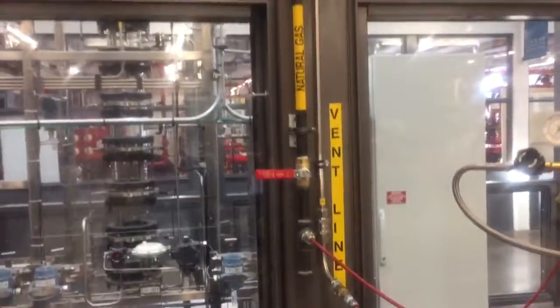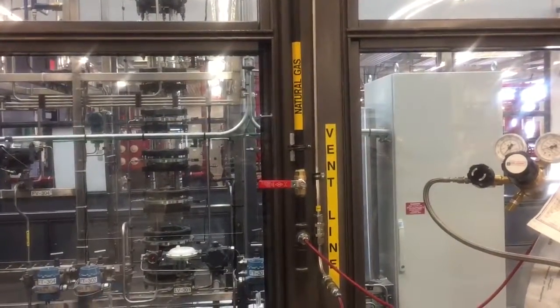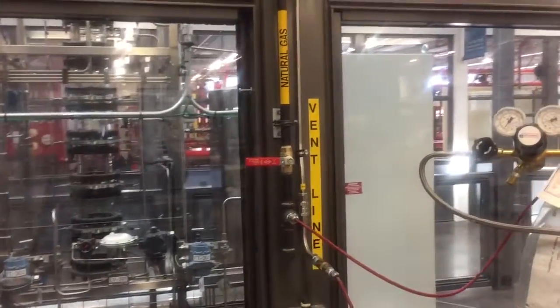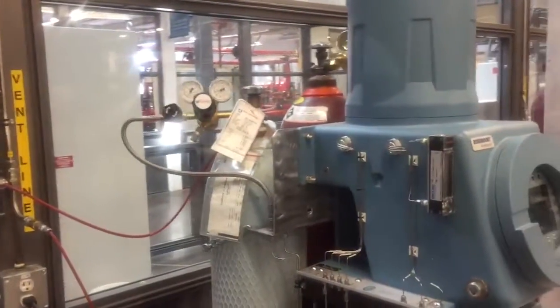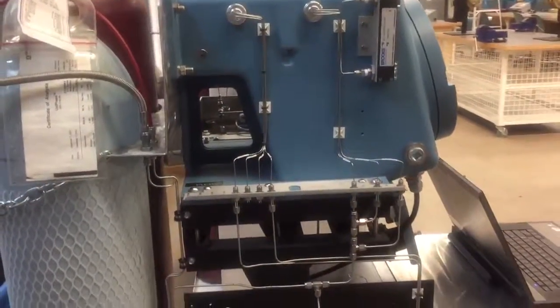We also have a live natural gas sample here from the college that's plumbed into the analyzer because that's what this analyzer is designed to do. It's designed to analyze and figure out how much of each component is in natural gas.